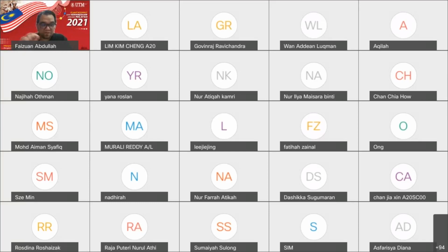We put a similar volume in every volumetric flask, with different volumes of the stock solution, so that we prepare X plus 0, meaning the blank, where we didn't put any standard solution from the stock solution. And then we prepare 0.25 ppm added with X. What is X? 20 ml of water sample that we don't know the concentration of.